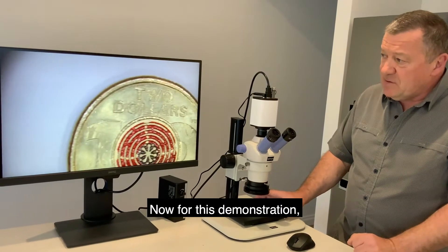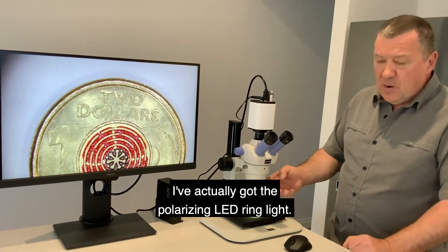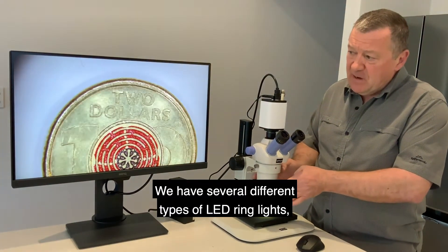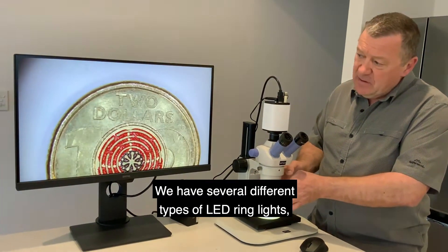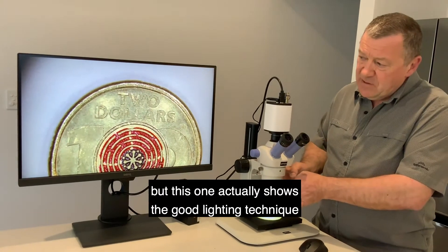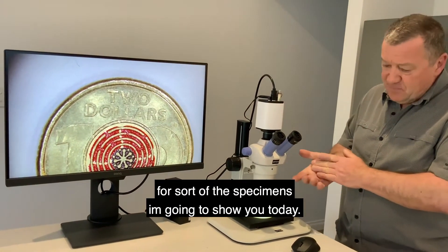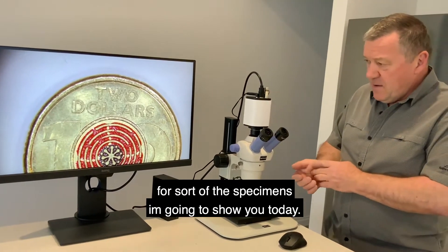For this demonstration I've actually got the polarizing LED ring light. We have several different types of LED ring lights, but this one actually shows the good lighting technique for some of the specimens I'm going to show you today.